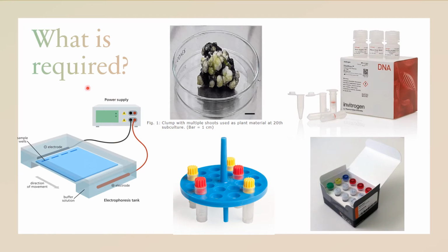Alright. The tool that we use in order to see the DNA is agarose gel electrophoresis. This is a gel, an agarose gel. The blue one is the agarose gel. As the name implies, agarose is like the agar-agar that we eat. It has jelly-like structures that interlink with each other. It has a well inside here, a lubang. You know, that's a well. So the sample well, the 4 right there that you see, is where we load our sample.